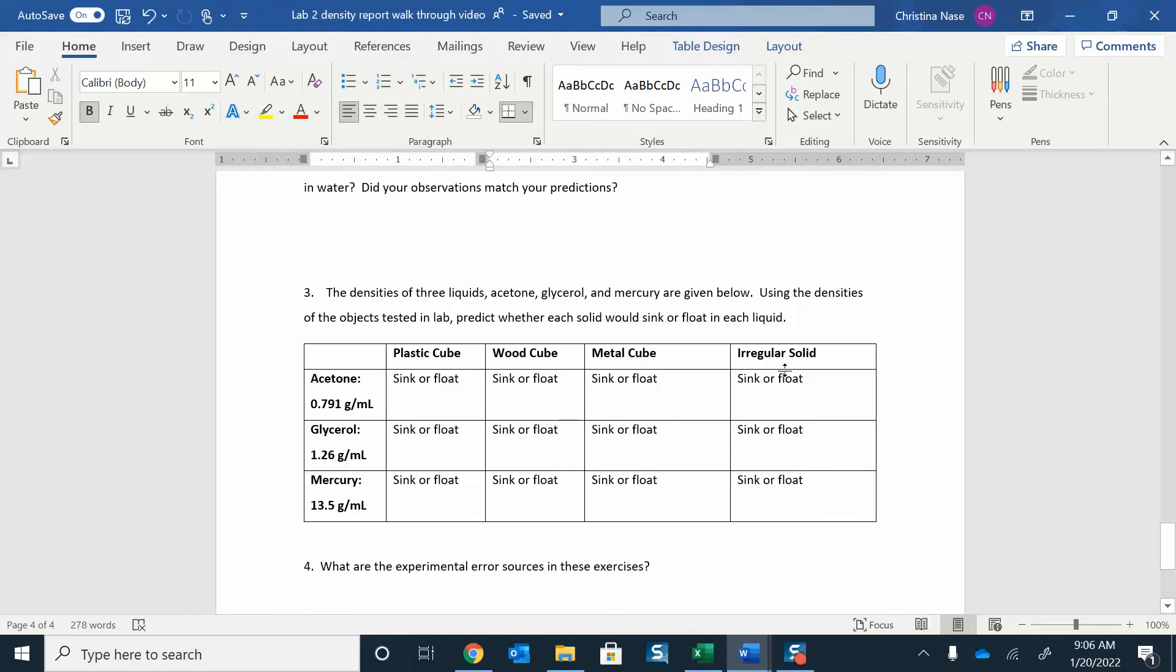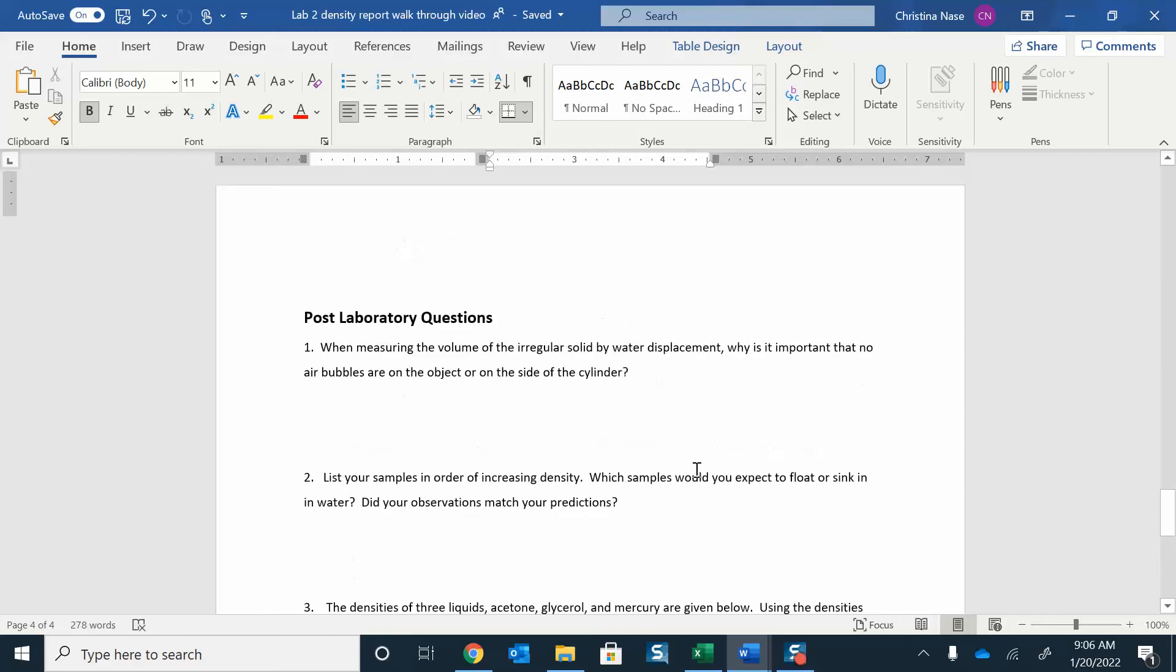And we're going to say, with this plastic cube, according to the density of our plastic cube, would it sink or float in these liquids? So let's do it for this plastic cube that I have here. The density is 1.4.